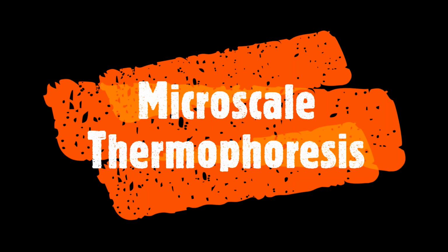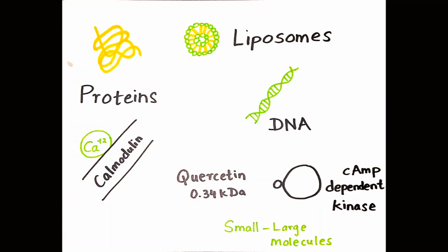Microscale thermophoresis is a technique used for quantitative analysis of protein interactions. Basically, any type of biomolecule can be tested using this instrument: proteins with other proteins, liposomes, DNA, and even small molecules. Due to the high sensitivity of this instrument, it does not really matter how big the weight ratio of the two interacting partners is. Measuring is even possible in complex bioliquids like cell lysate.